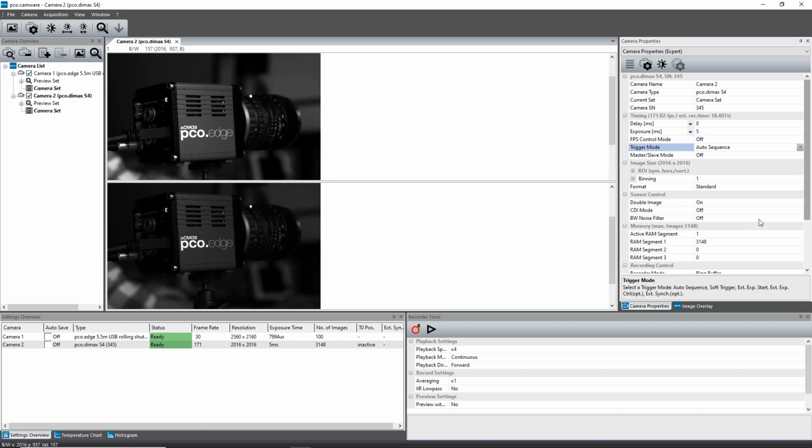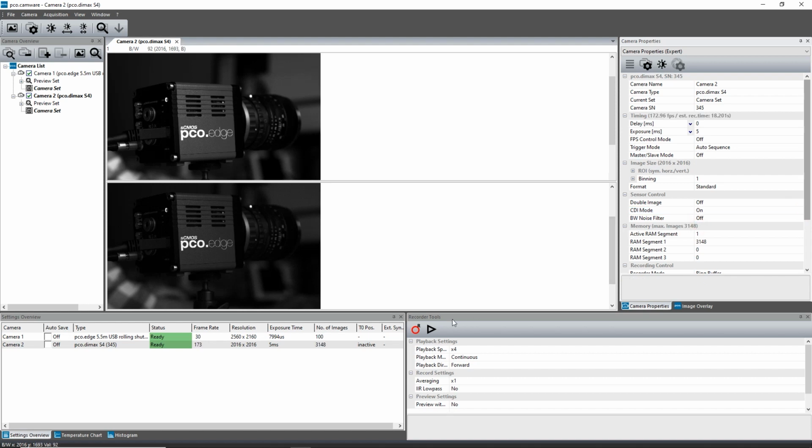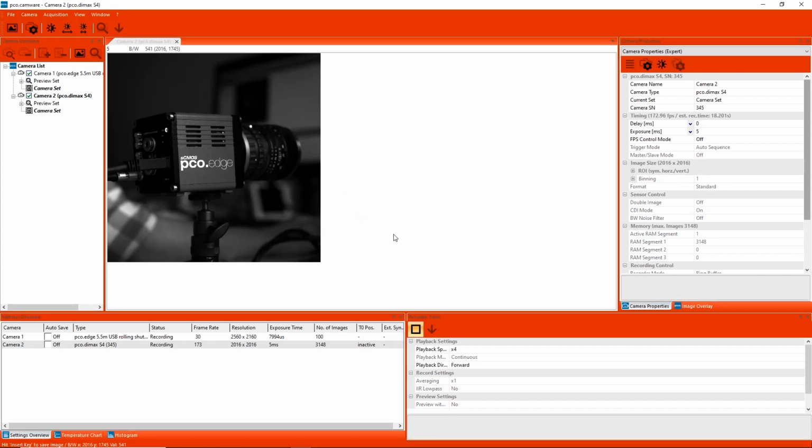The CDI mode indirectly refers to an additional shutter mode. It records images with increased dynamic range and a 30% better performance on weak signals at the expense of half of the usual frame rate because 2 images are acquired and correlated.